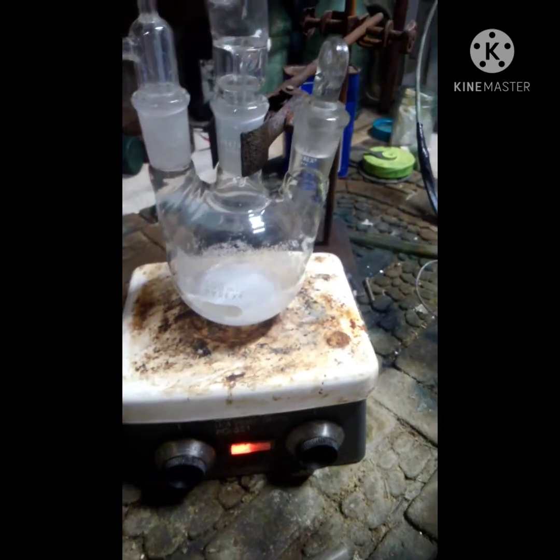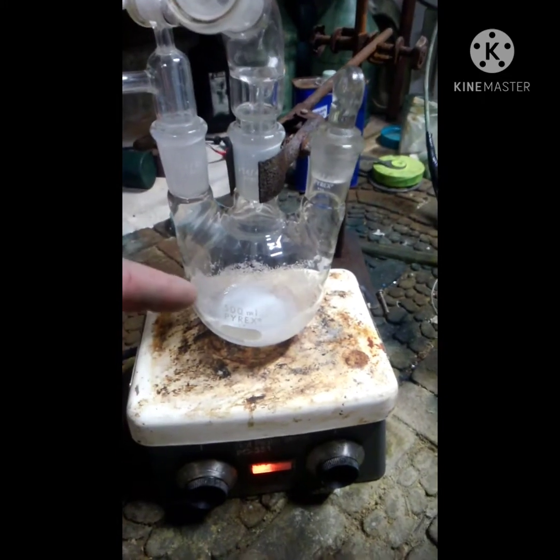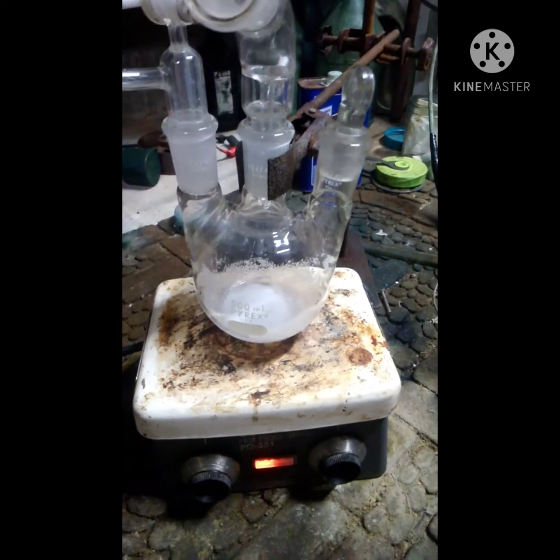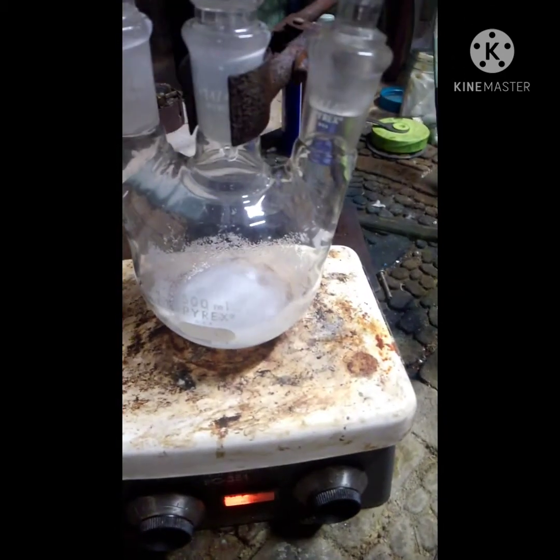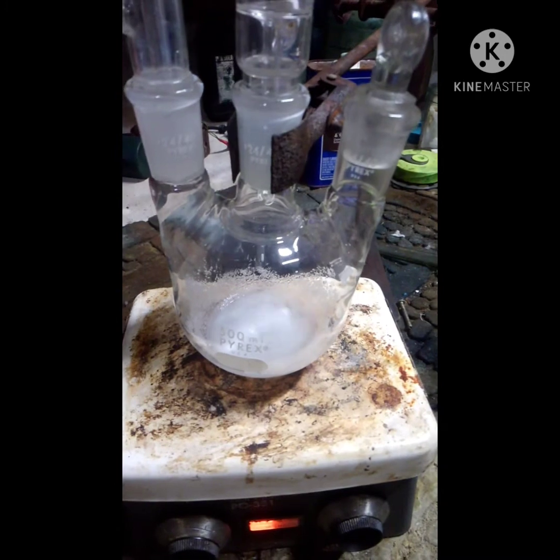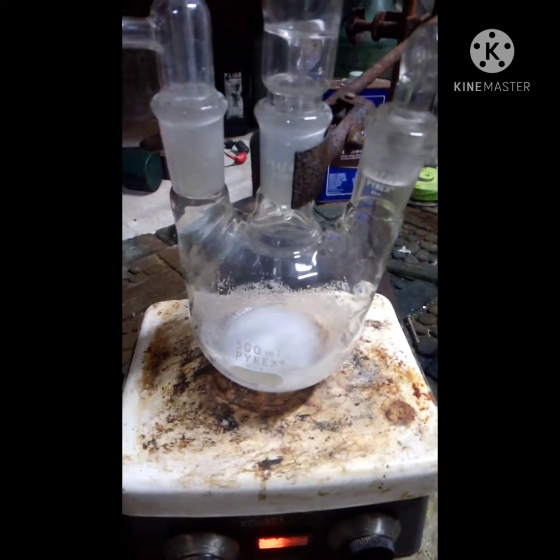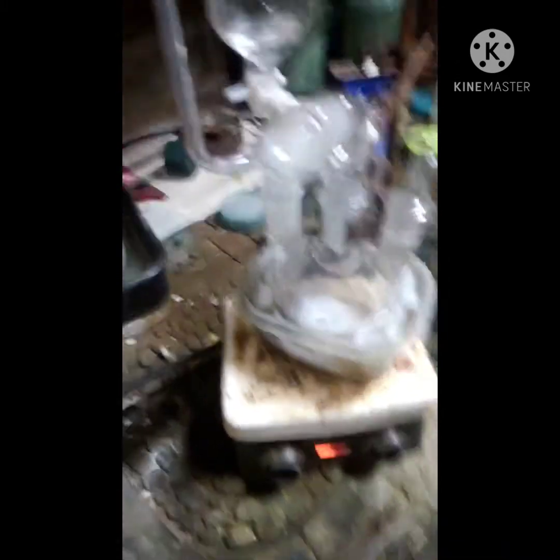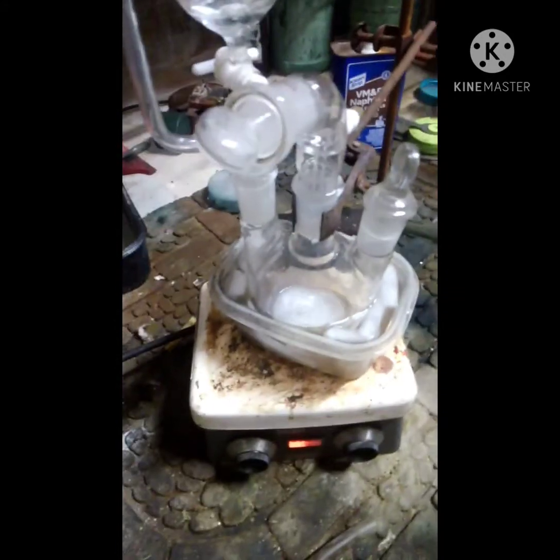The one thing I still need to do is put this in the ice bath before I start adding the glacial acetic acid. I wanted you to see this mix before I put it in there, because it's going to make it harder to see. So I'm putting this in the ice bath now — and boom, ice bath. Now I'm going to start adding the glacial acetic acid at about a drop a second.